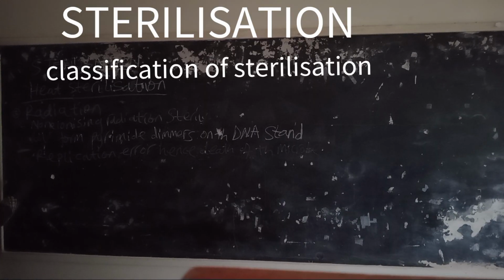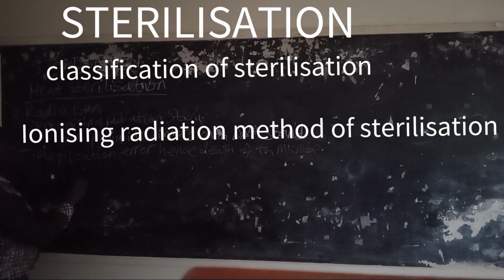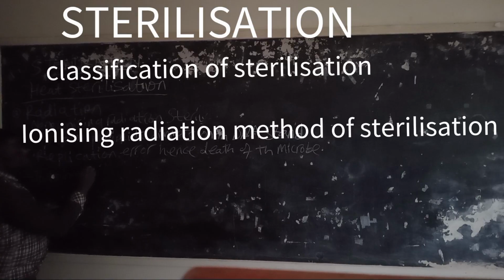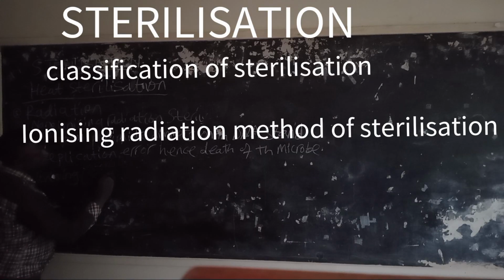Then we have ionizing radiation sterilization. With ionizing radiation, we use rays like X-rays or gamma rays.